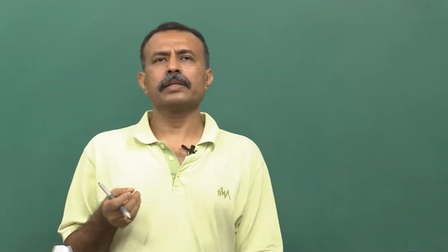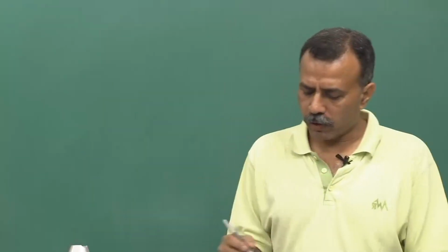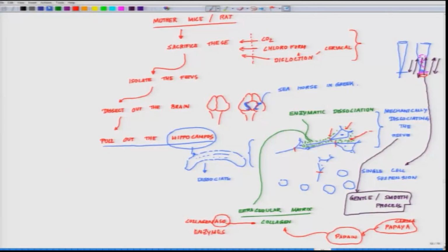The way papain works, and this will be very important in phase 2 of it, you will realize why, is this. Say this is the tissue and these are the cellular elements in the red dots. Now, let us represent papain molecule as green; it infiltrates into these zones.